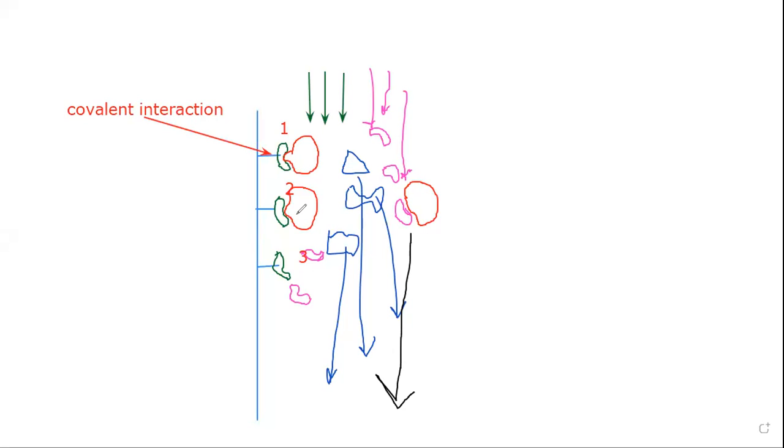Yes, sir. Now my question to you is, now we have this complex with us. When we pool together the fractions, in one of the pools we have this complex. The next question to you is again, how to separate the complex? Because we want only the desired molecule. We don't want that ligand associated with it for any of our further applications, or any of our analysis maybe. We want only the purified component. So how are we going to purify that?